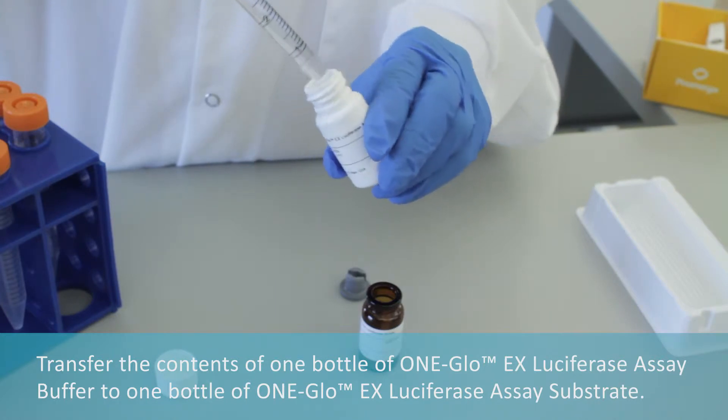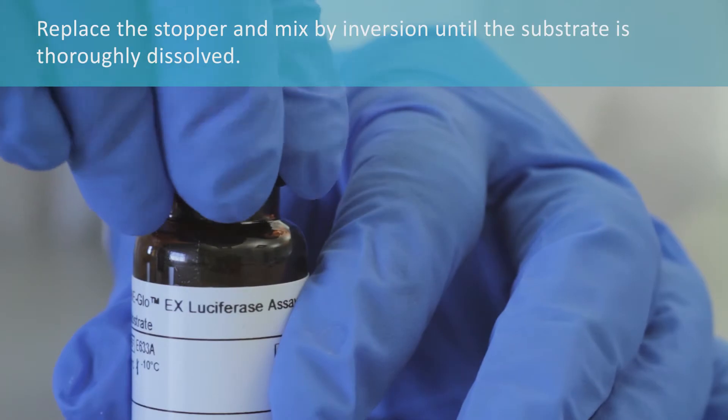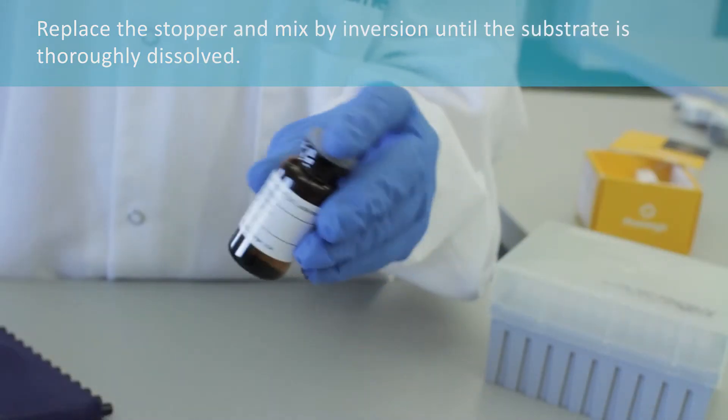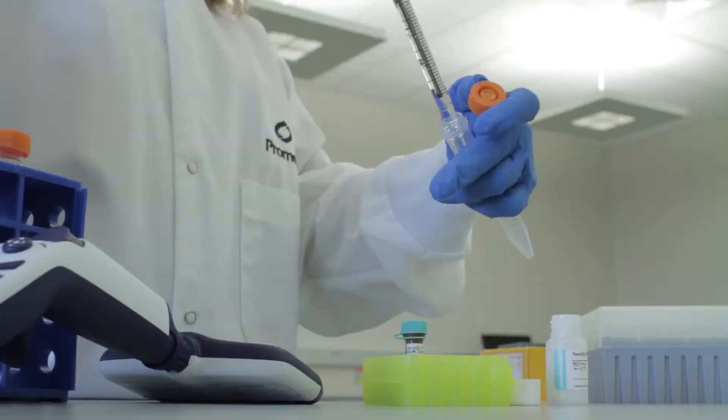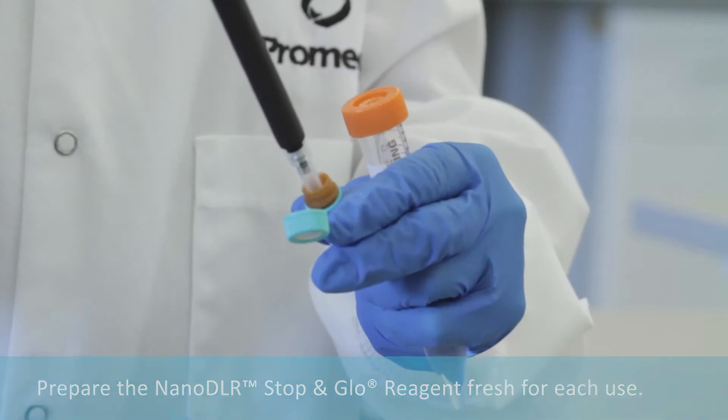Replace the stopper and mix by inversion until the substrate is thoroughly dissolved. Prepare new Nano DLR Stop-and-Glow reagent fresh for each use.